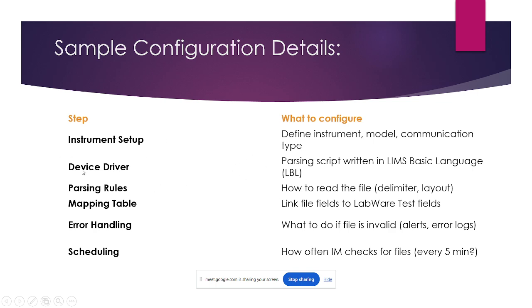Configuration details: these are the instrument setup and device drivers and all those things. Majorly, instruments can also be integrated, and also printer drivers. Some device drivers means printer devices. Sometimes for printer devices, like report or port-based file types, we need to set up printer device drivers. In this printer device driver also we need to create the parsing scripts, and only after creation of the parsing script are the results extracted from the application to LIMS.